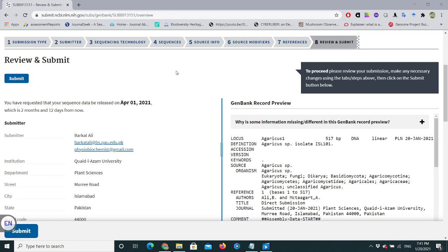So this was about how to submit nucleotide sequence data through NCBI. Hopefully this video will be useful for you, especially those who are new to sequence submission in NCBI. Thank you so much.